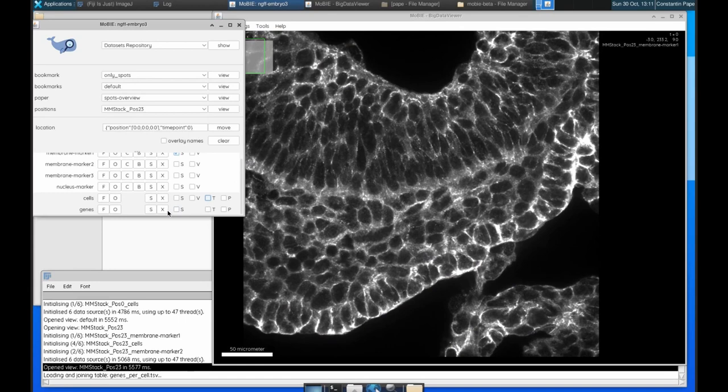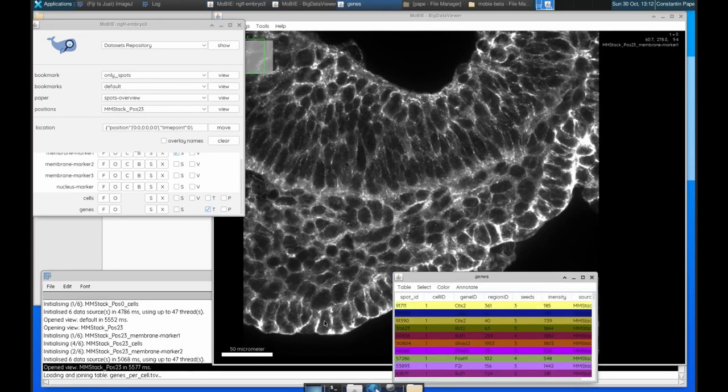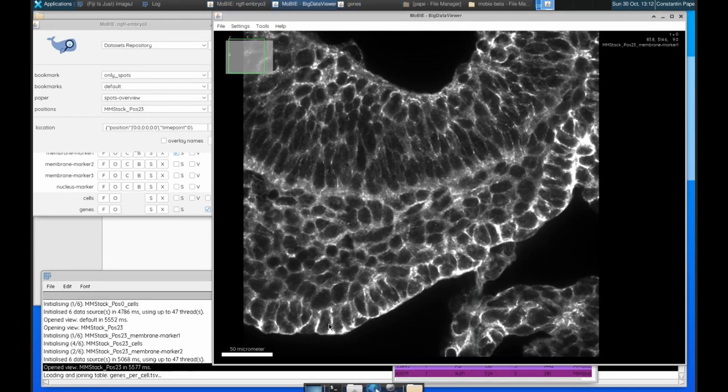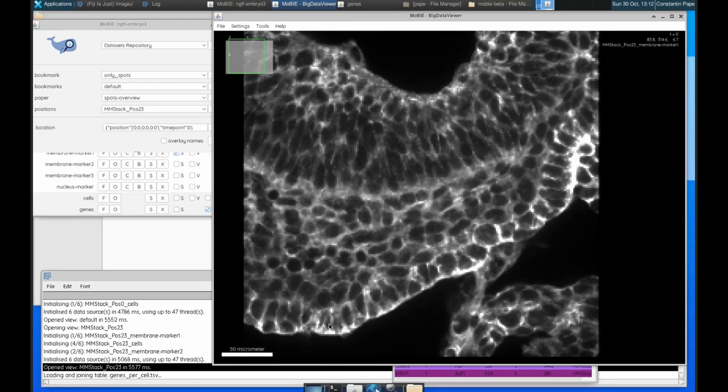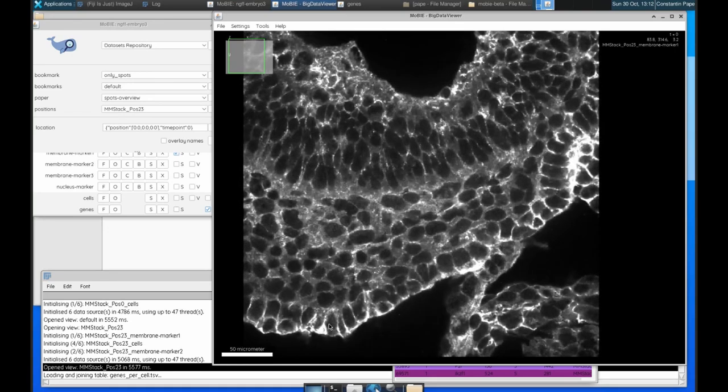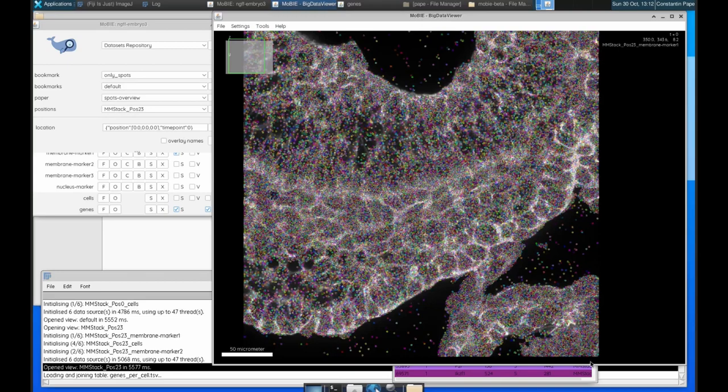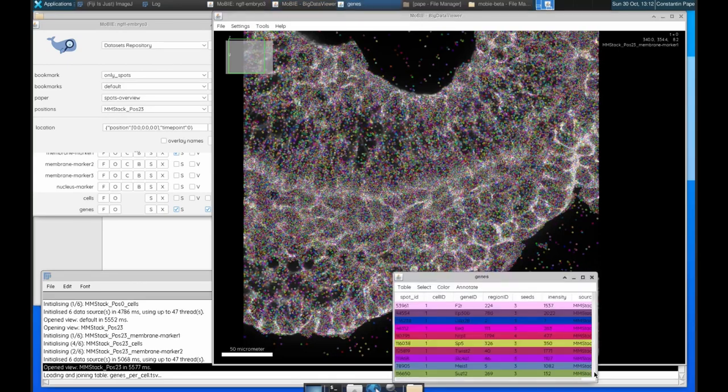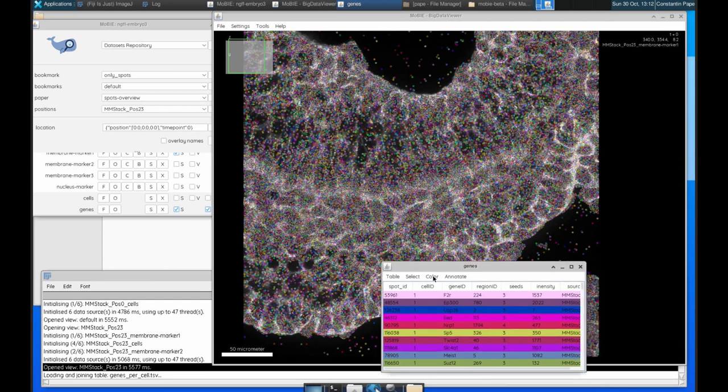So just to give another example, if you want to go from the other direction, say there's some data in Mobi that you want to be able to get out and then do your own analysis with, that is also possible. So for example, here we're looking at the spots with the gene expression, and say you're interested in this intensity column. What you can do is you can color by that column, as we've been doing before.